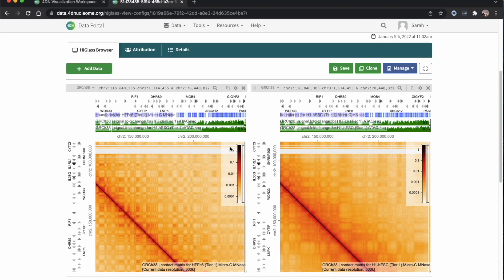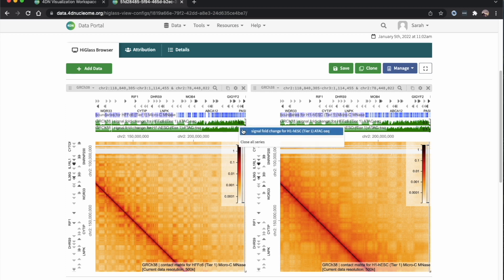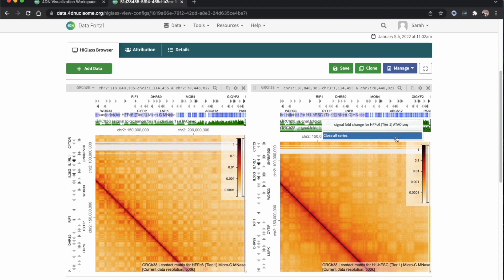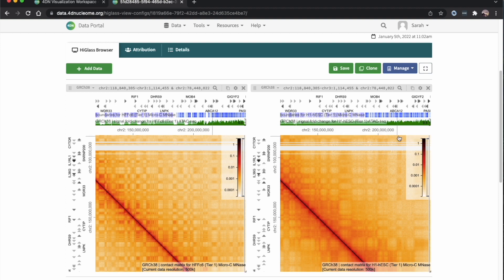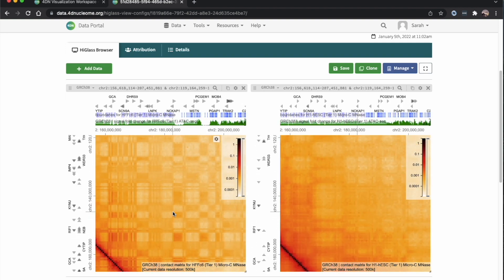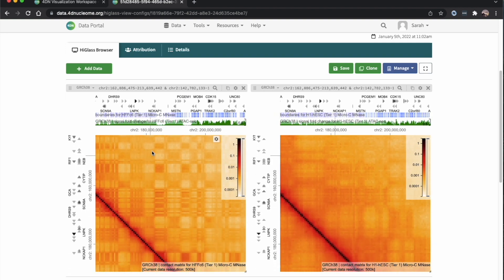Then I'll do what I did before. I'll remove the H1 track from the left and I'll remove the HFF track from the right. Now I'll just zoom in a little bit more.